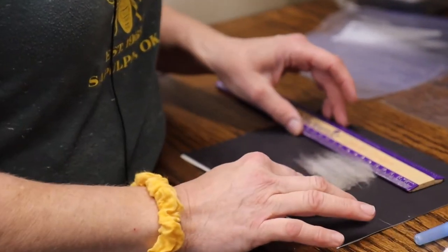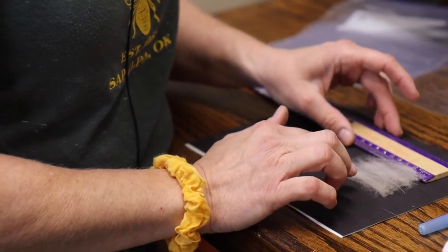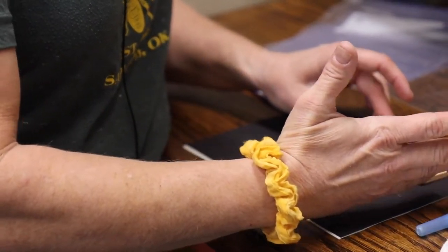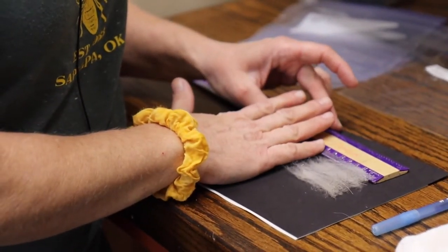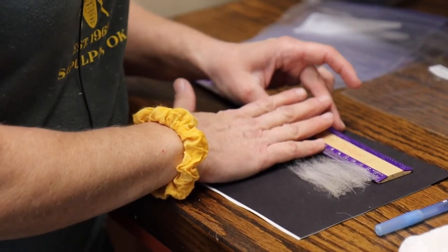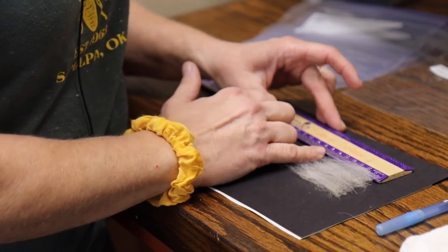I have my ruler here, so I'm going to lay that out and put my ruler to approximately where the cashmere starts, then look to where the cashmere ends. On this sample, I would say that the cashmere ends at around 67 millimeters.